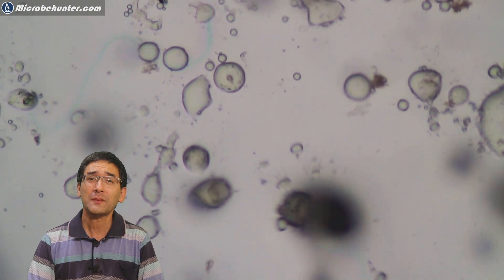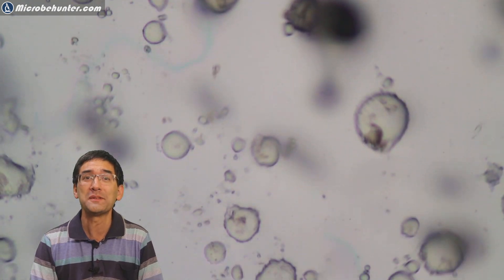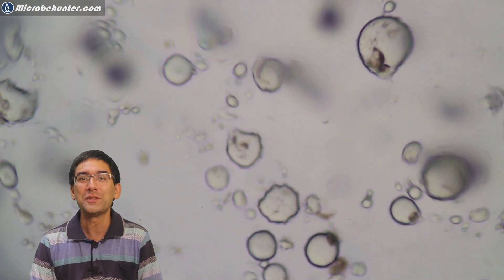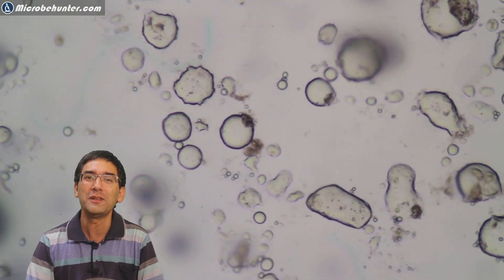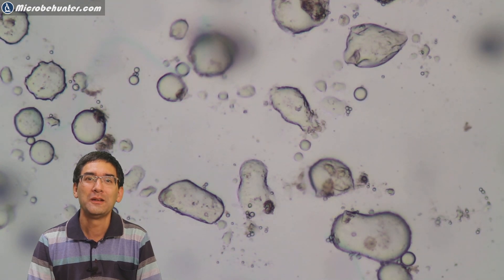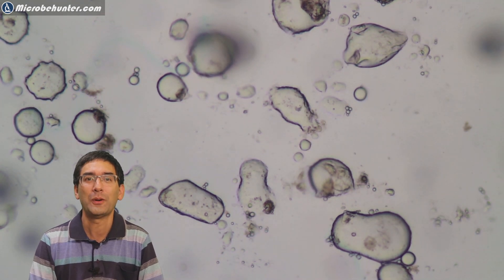As a matter of fact, there are probably so many different substances in a hamburger that it's almost impossible to identify them. But some of them, like those fat droplets, are very common and recurring little structures that you find quite often.